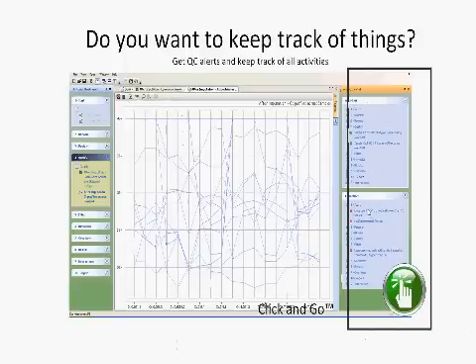And then you also have the exceptions panel. And the exceptions panel is a little bit different because as you're going through the analysis, you're going to start to see that perhaps the quality of the data needs to be checked. So if there are some red flags that appear here, that means just go back and review exactly maybe the technical replicates, maybe the biological replicates, how you filtered your data, what the endogenous control was that you used, and it really provides you a lot of information that could be useful when it comes to the quality control.